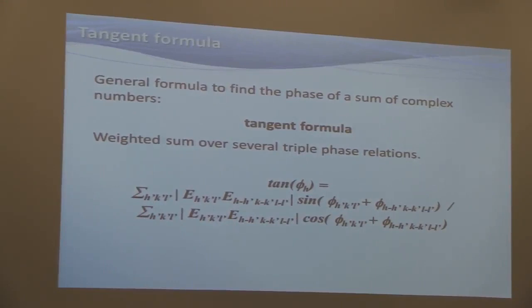These statistical methods only work because electron density has certain features. For example, it is never negative. It is not usually 0. And atoms don't tend to lie on top of each other. Atom separation is required for these equations to be true.